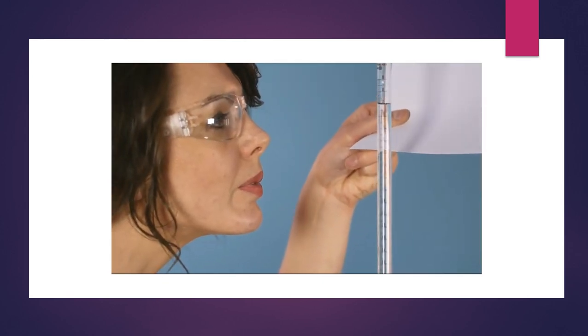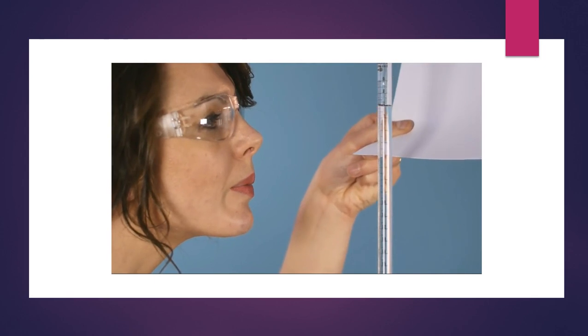Next you'll need to record the level of the solution in the burette. It can be tricky to see the meniscus clearly. It helps to hold a piece of white card behind the burette so that it lights up the bottom of the meniscus. Take the first burette reading with the meniscus at eye level. Take a reading from the bottom of the meniscus to the nearest 0.05 cm³, and make a note of the reading.